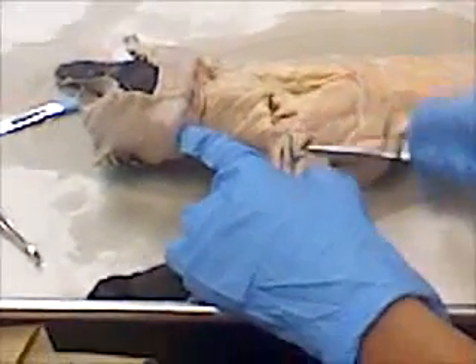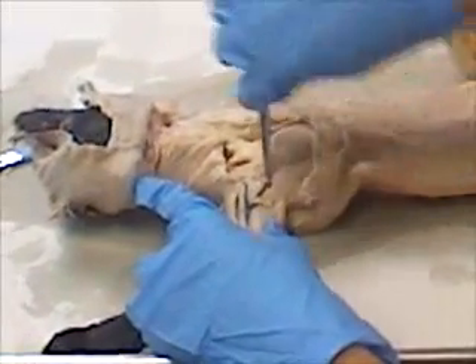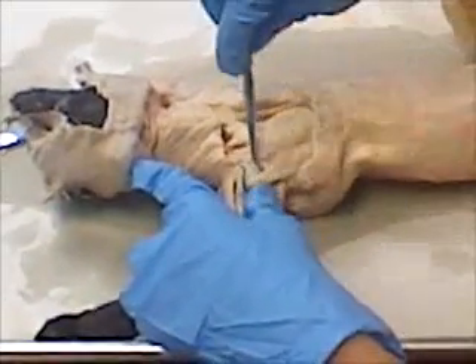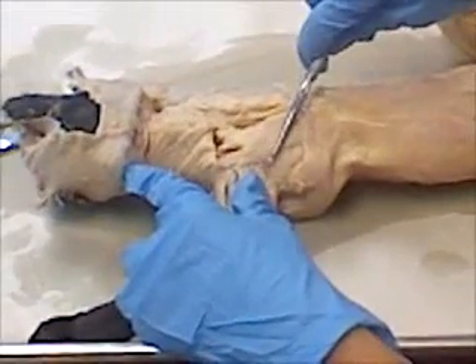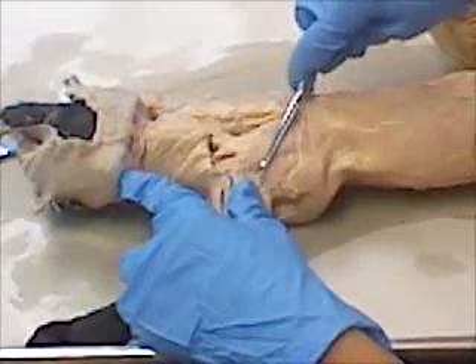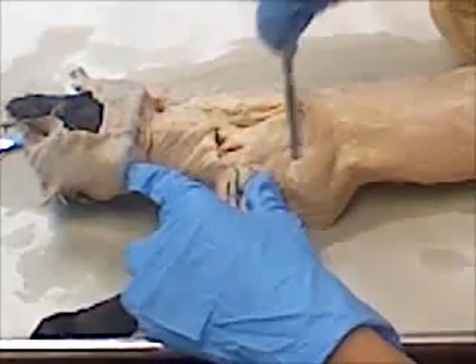And then this one is acromio deltoid, and this one is spinal deltoid, and — no — that's acromio, acromiotrapezius, and spinal trapezius.